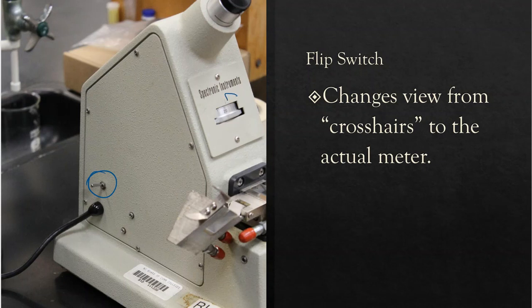Something else that I also want to mention is this dial on the front. This is a fine adjustment tool, all right? So fine adjustment. Sometimes people's eyeballs work a different way, and when you look through the eyepiece, things might be out of focus. If they're out of focus, then that's the purpose of the fine adjustment tool.